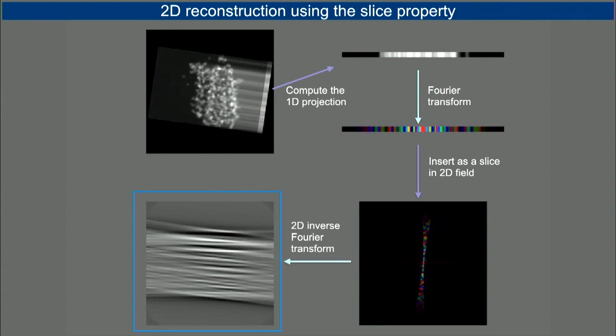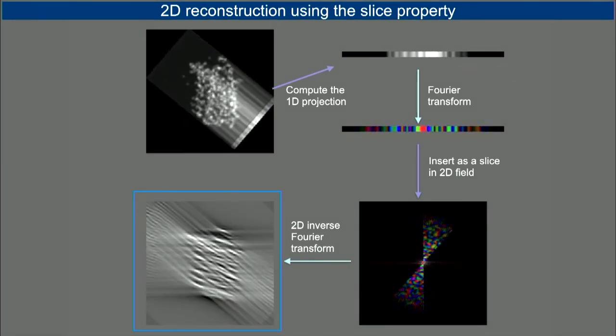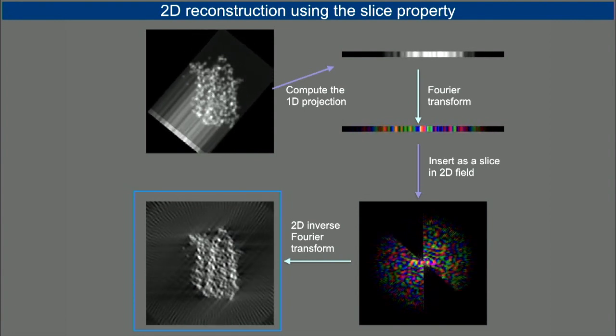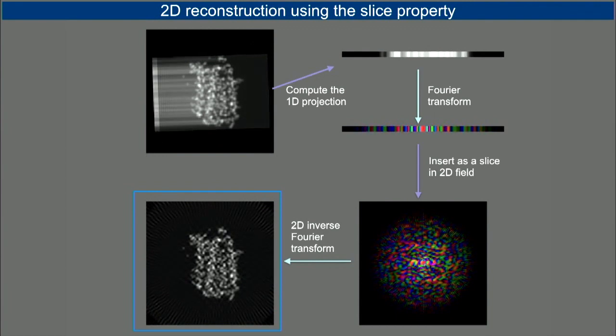And you can see that as we insert them into different slices, this sort of back projection looking thing begins to change its appearance. Then as we compute lots of these terms, we start to get better and better reconstruction of the original object. So that when we have inserted slices in a sufficient number of angles so that we have specified the value of voxels everywhere in the plane, then we can make a good 2D reconstruction.